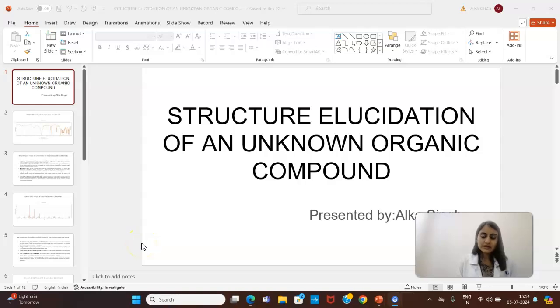Good afternoon. My name is Alka Singh, and today I'm going to give the presentation on structural elucidation of an unknown organic compound. So first we will start with this slide.